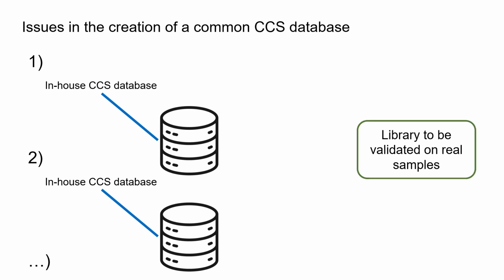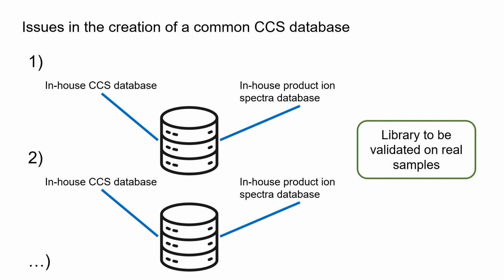If the precision under reproducibility condition of empirically derived CCS is high enough, which we know it is, we can use the database for screening analysis. This is also the rationale behind the use of product ion spectra, for example. The different collision chambers, geometries, as well as the non-standardized collision regimes prevent the exchange of spectra across different tandem quadrupoles or high-resolution platforms.